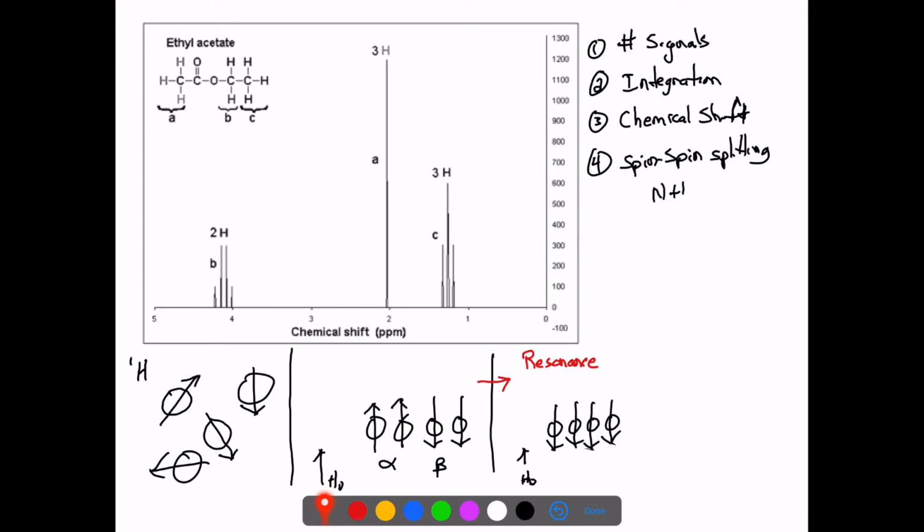So let's just take this for C. There are 3 of these hydrogens, and these are equivalent, and they don't split each other, but they are split by the 2 non-equivalent hydrogens here, the neighbors. So n is 2, 2 plus 1 is 3, and so the signal will be split into a triplet, and we see that, 1, 2, 3. So we see that there.